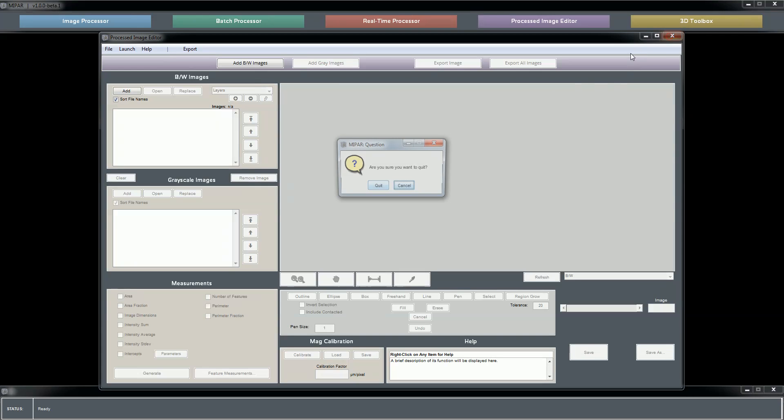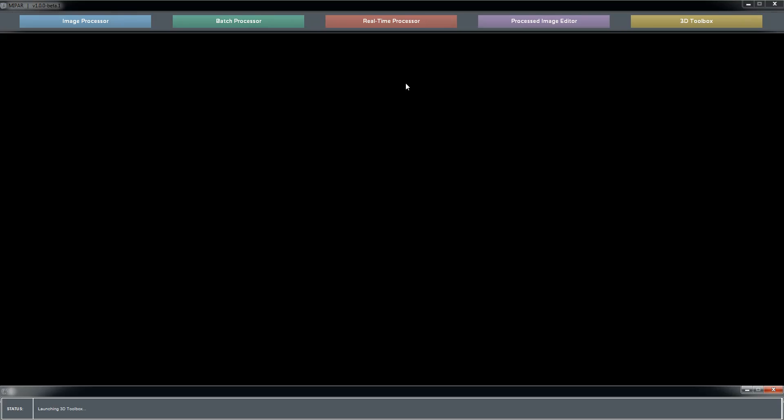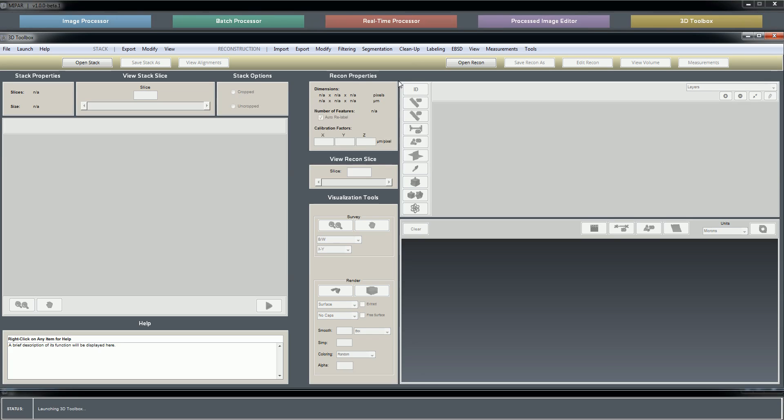The 3D toolbox may be never used by some of our users if they're only interested in 2D processing, so I'll just quickly go over this. Your image stack will be viewed and manipulated here on the left, your reconstruction on the right.